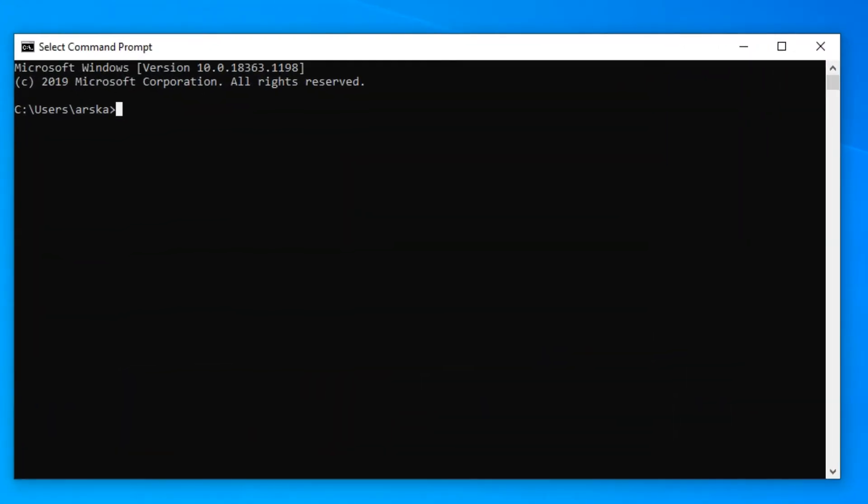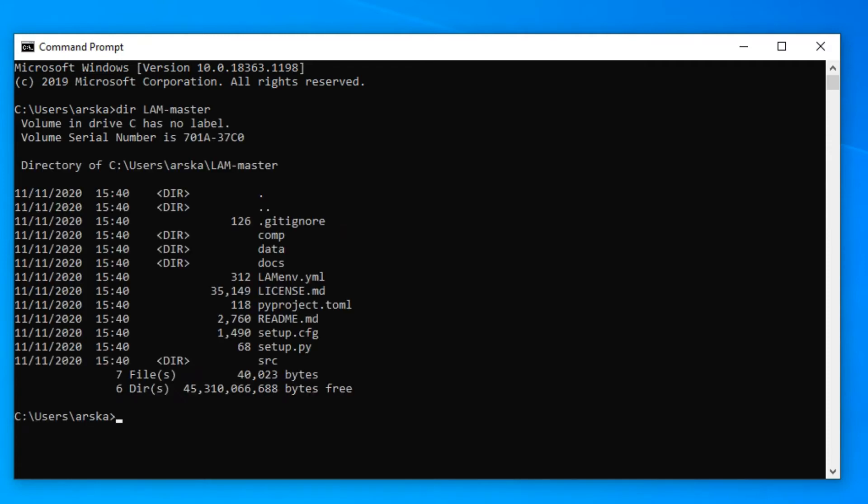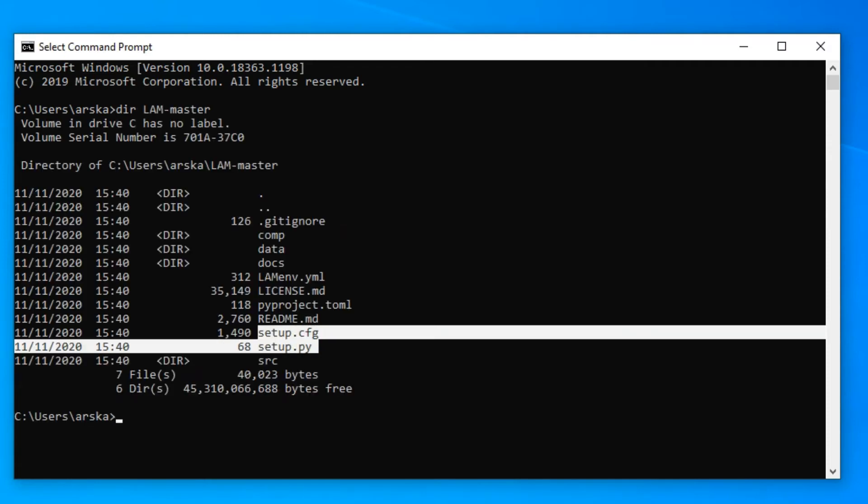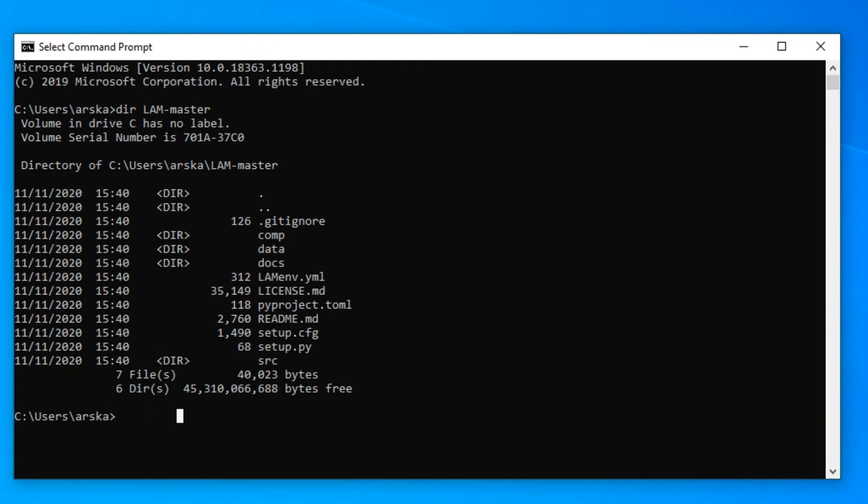LAM includes a setup file that handles installation of LAM and its dependencies. However, it is recommended to create a dedicated virtual environment for LAM in order to avoid any dependency clashes.